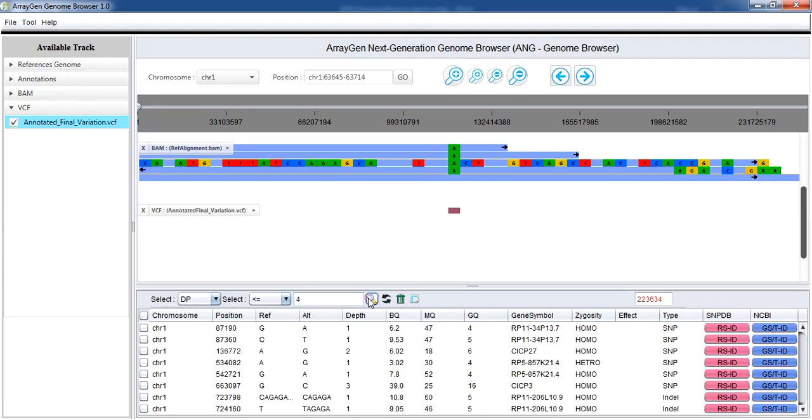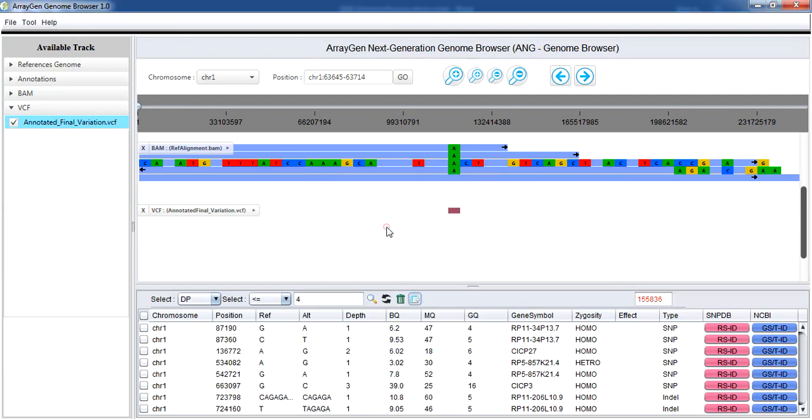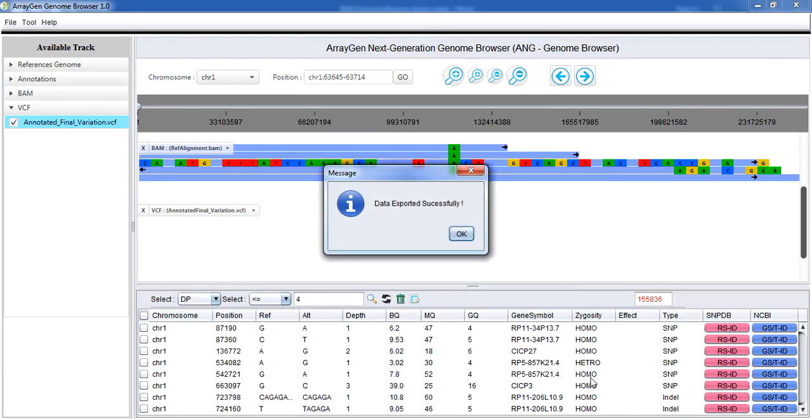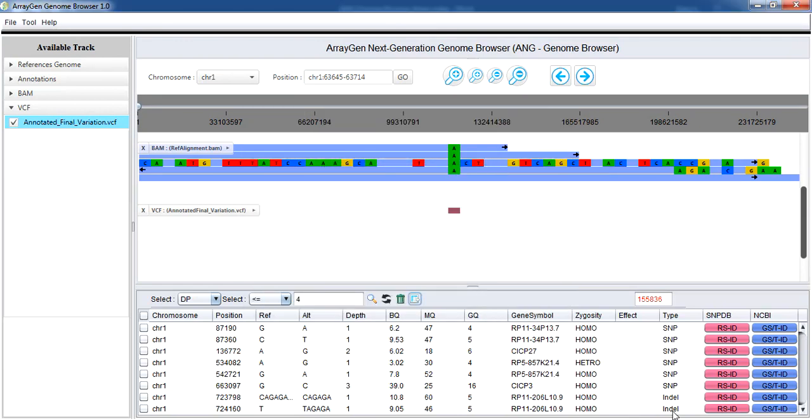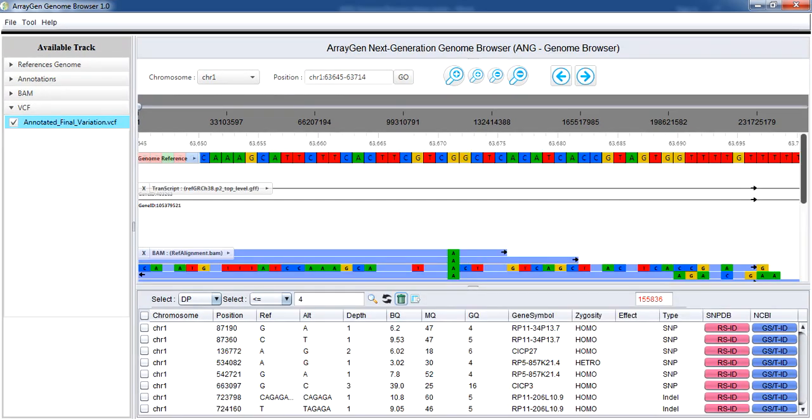It can be exported in VCF or tab delimited format. As demonstrated, the SNPDB and NCBI icons take you to the NCBI's SNP database and NCBI's gene pages for particular variation.